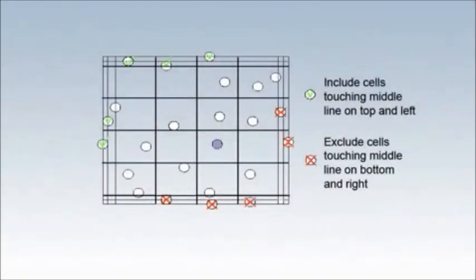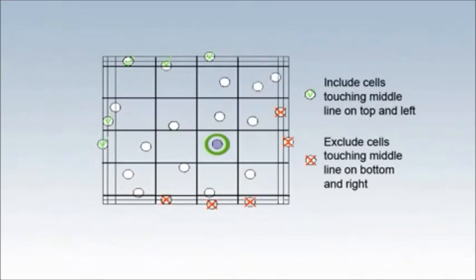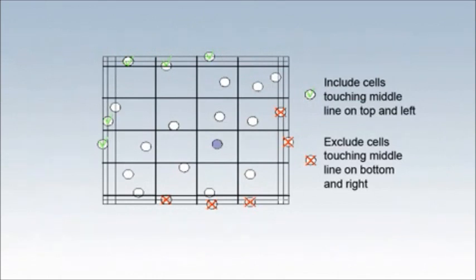First, count the number of viable cells seen as bright cells. Then, count the non-viable cells which are stained blue. Make a note of the number of large corner squares counted. Ideally, 50 to 100 cells should be counted. This increases the validity of the cell count.